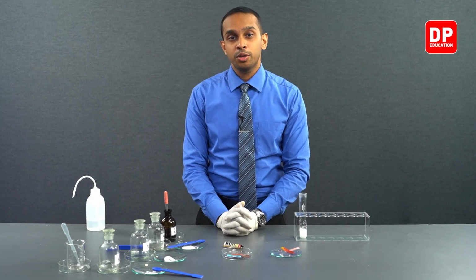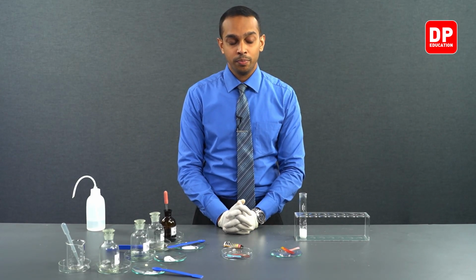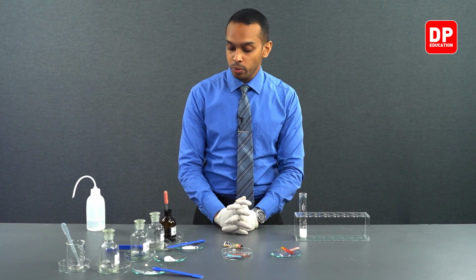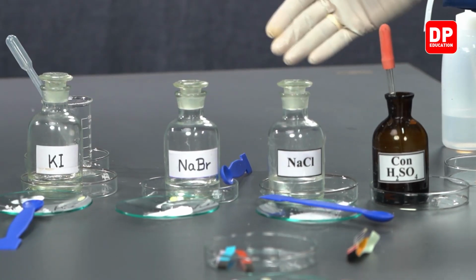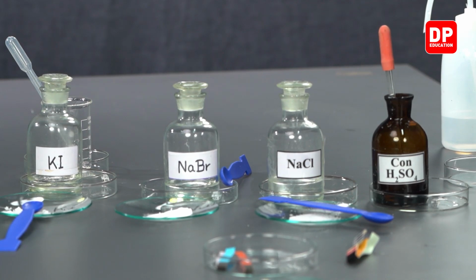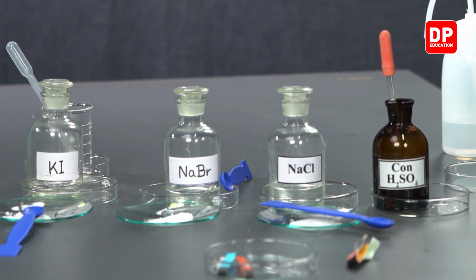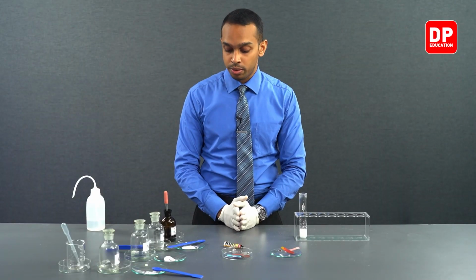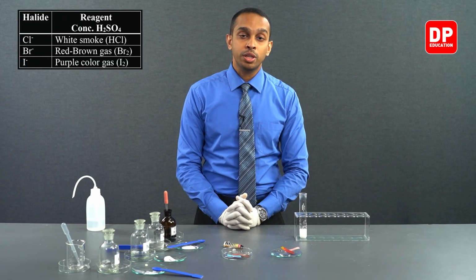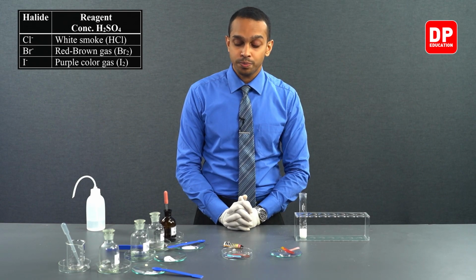That brings us to the end of this practical 13. In the last section of the practical, we looked at how sodium chloride, sodium bromide, and potassium iodide react with concentrated sulfuric acid. To summarize, potassium iodide, when added with concentrated sulfuric acid, we saw the evolution of a purple color gas, which is I2.